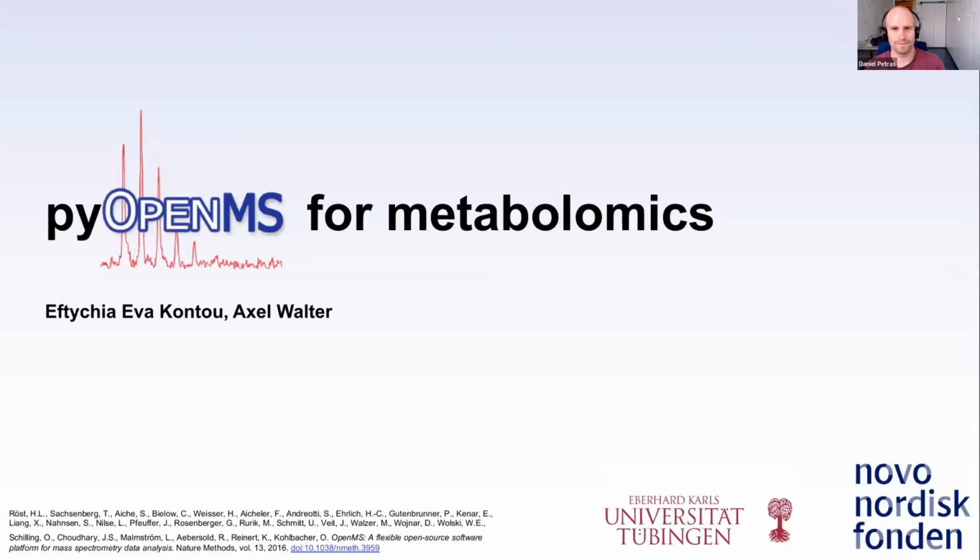Hi everyone. Today we will take a look at pyOpenMS and how you can use it for your metabolomics workflows. In this workshop, we will give you a short introduction on pyOpenMS and also on all the steps that are necessary for the pre-processing. And then we will have a hands-on session, and everybody that wants to follow can open a Jupyter notebook in the browser and go along with the interactive example.